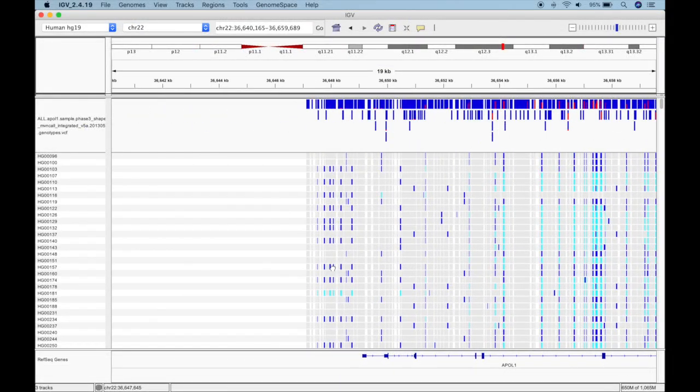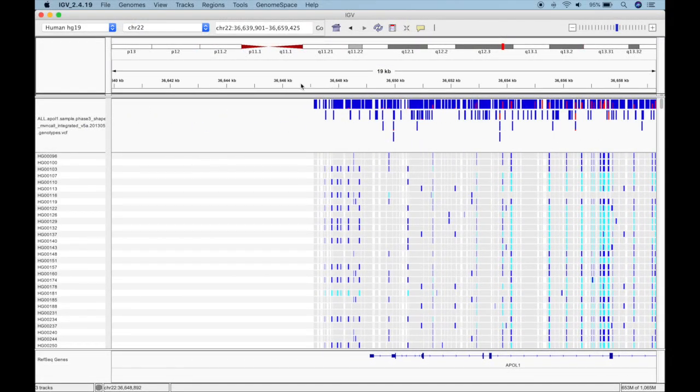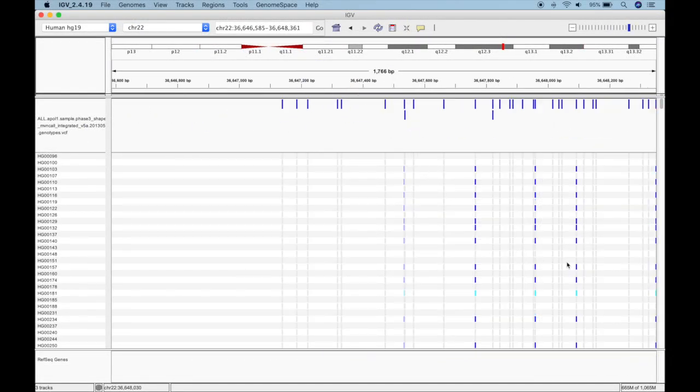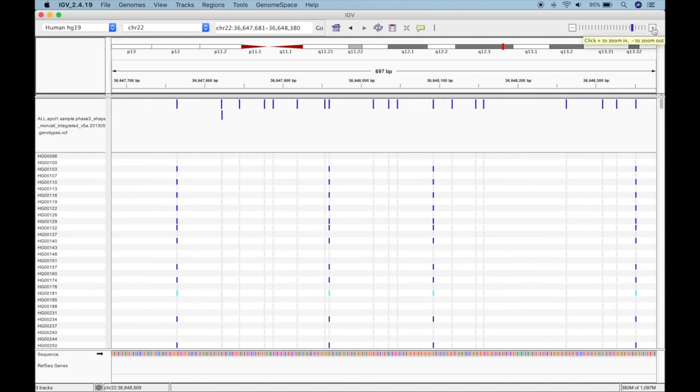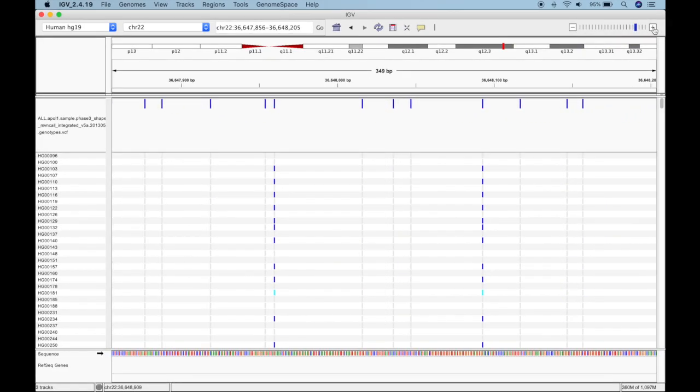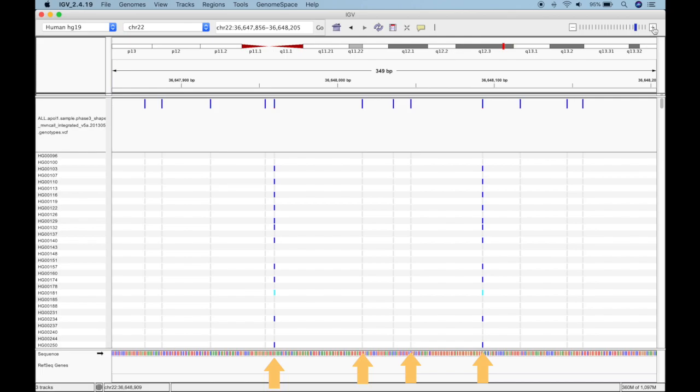If we zoom in even more, we can see that not all locations have data. Do you remember how each variant got one row of data in the VCF file? Well here, every location with data represents one row in the VCF file. And the places without data are simply genomic regions without variants in our VCF.